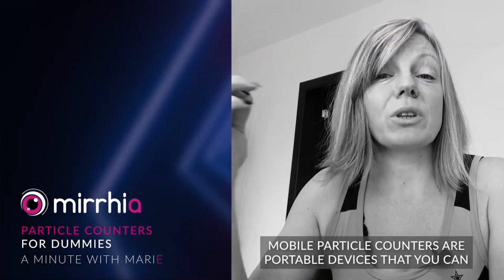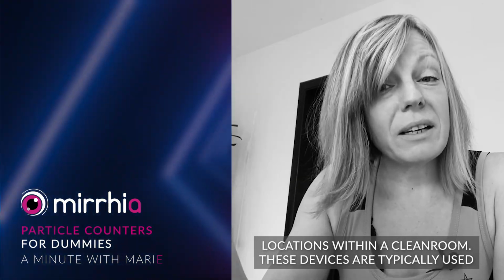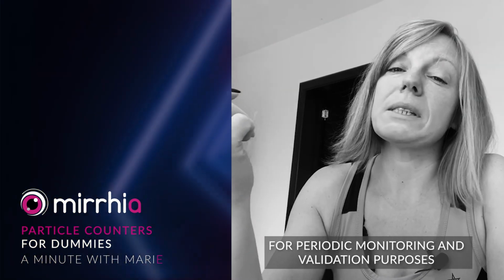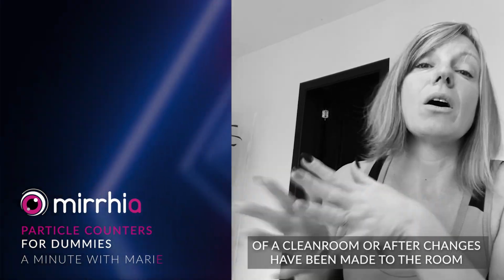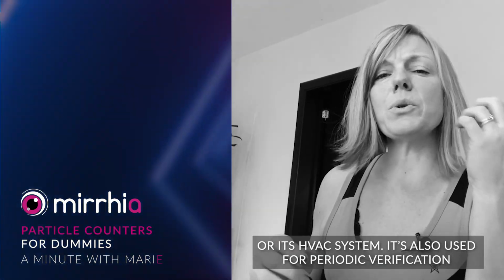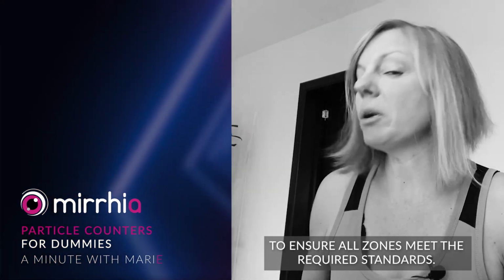Mobile particle counters are portable devices that you can move around and use to take measurements at various locations within a clean room. These devices are typically used for periodic monitoring and validation purposes. Some examples? A mobile particle counter might be used during the certification of a clean room or after changes have been made to the room or its HVAC system. It's also used for periodic verification of the particle counts in different areas of the clean room to ensure all zones meet the required standards.